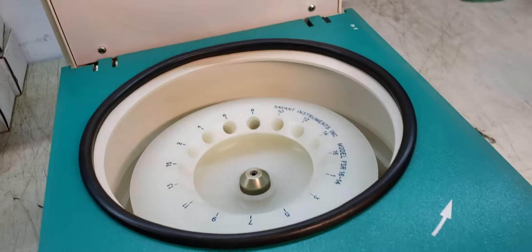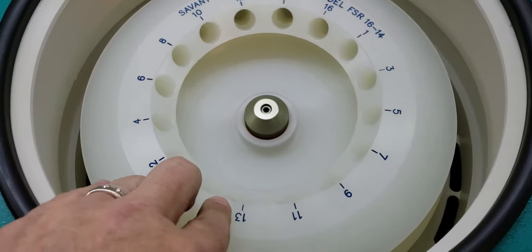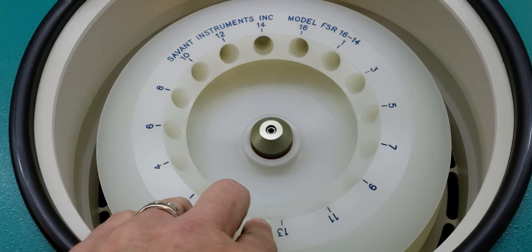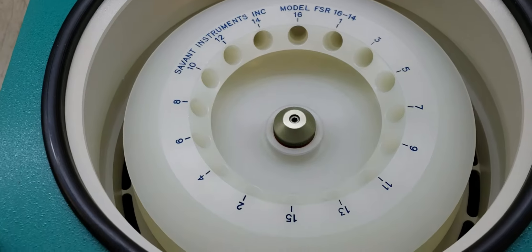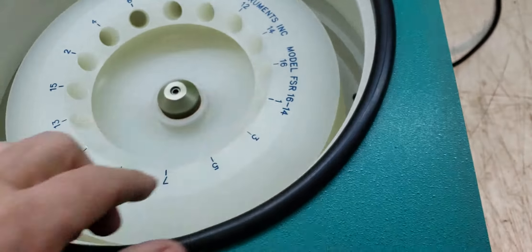Maybe it's this one — there you go. So there's the top open. You can see it's got a Savant Instruments model FSR 16-14. I imagine that means... no, it doesn't have 16.